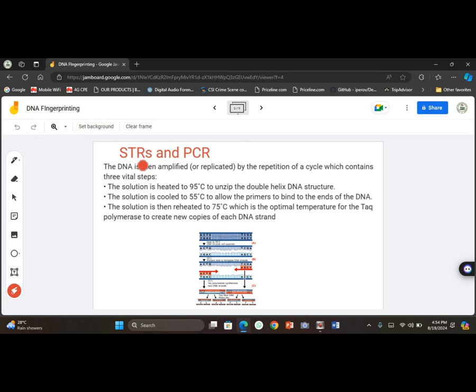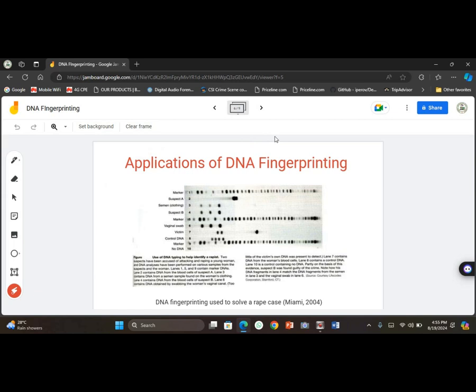That is why at times, if you suspect that there is contamination when you are using STR, you amplify it, then use either of the 2 previous methods, because those 2 methods are not affected by contamination, but STR can be. But you have to do something to prevent contamination, and that will be discussed later in this lecture.